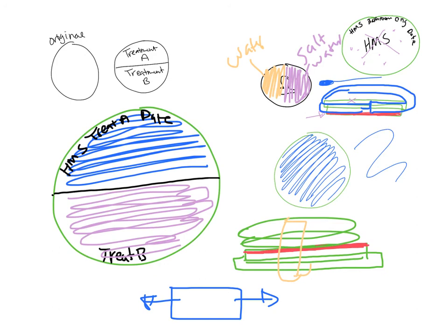Okay, so that's the basic idea. I hope that helps you understand where we're going with it. And like I said, I'll post a couple other videos with some techniques as well. But this is the basic technique that we're doing with just the streaking straight across the plate.